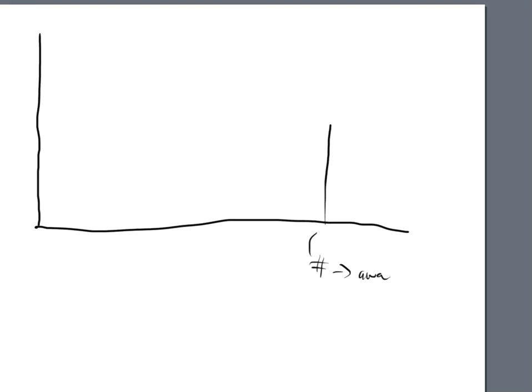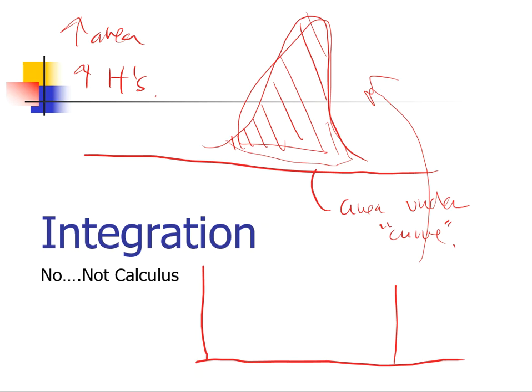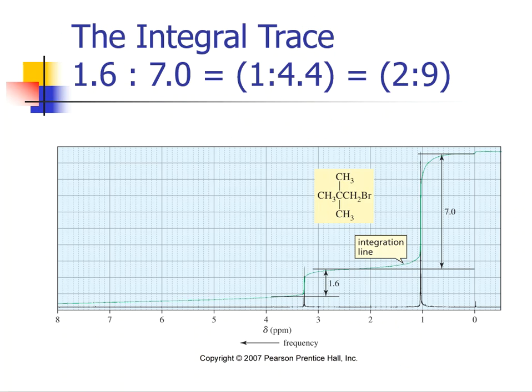All right. So just kind of jumping into the pool without being able to swim, I want you to take a look at what one of these examples might look like. And it looks like something like this. All right. So here's an NMR. Again, there's a signal here at 1, and it looks like a signal here at like 3.3-ish or right before 3.3-ish.